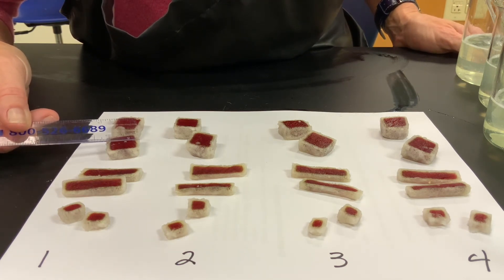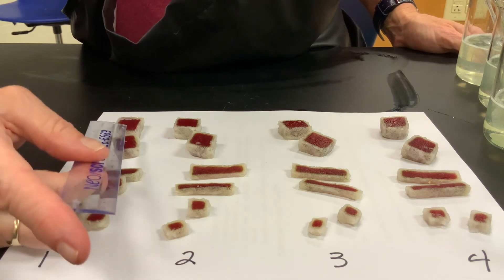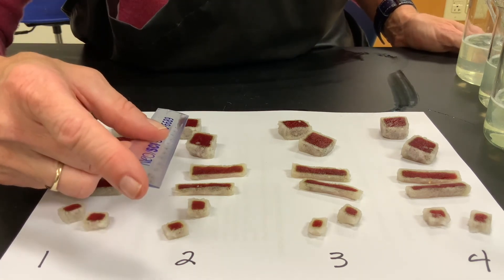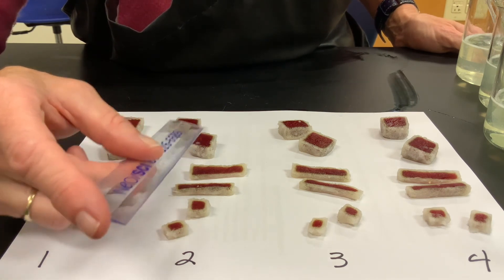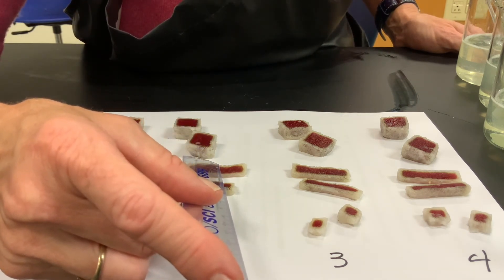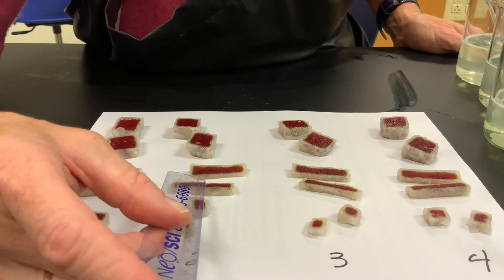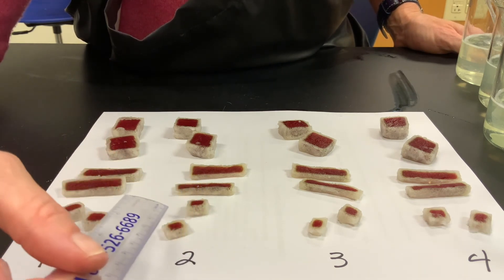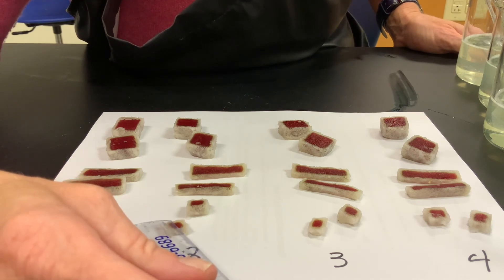The 2 by 2 by 2 cube is also 2 millimeters on all sides. Looking at all of them, we had super consistent data — 2 millimeters across every shape.